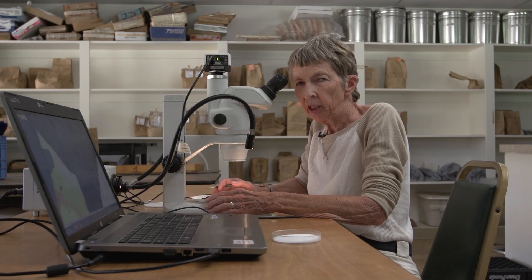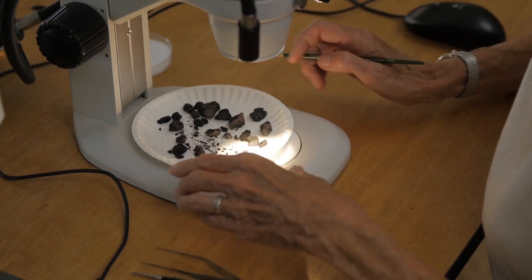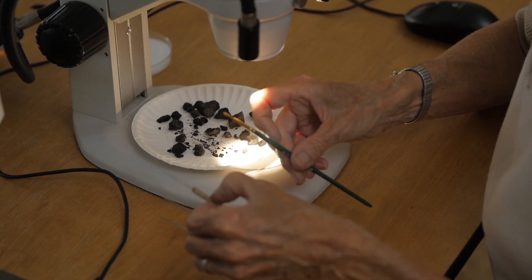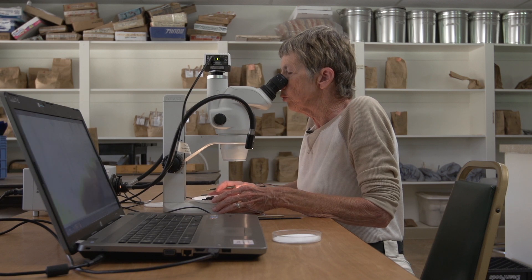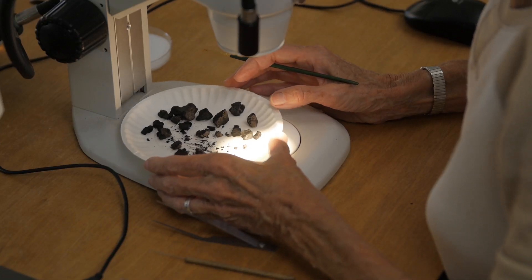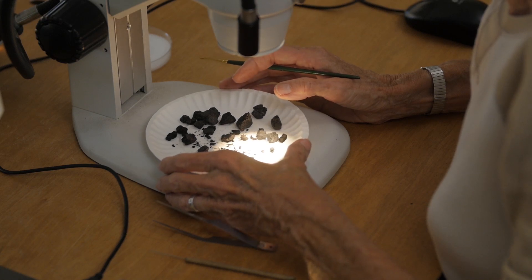Now our sample is dry and I have it spread out on a plate here. I'm getting ready to look at it through the microscope. My tools are simple — a paint brush, a little tweezer, and a little probe so I can move things around. What I'm starting to see is some of the woods that were used for the fire in the hearth. I can see juniper wood and pinyon wood. These woods would have been quite common around this area in prehistory as they are today.